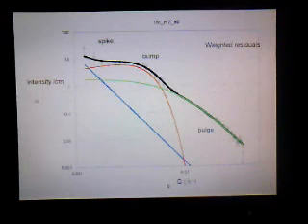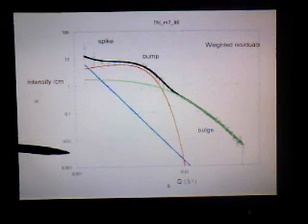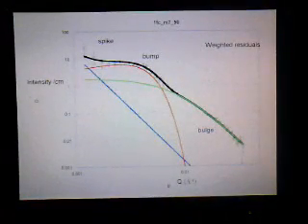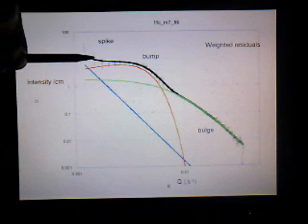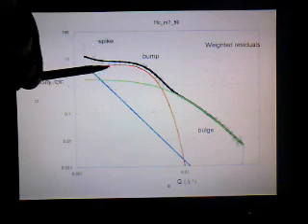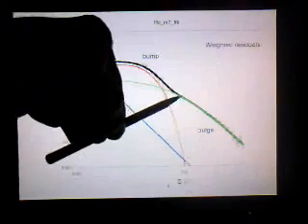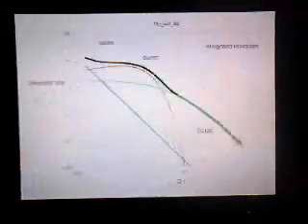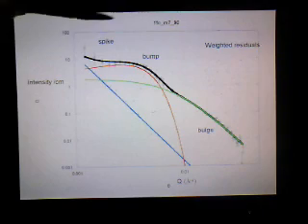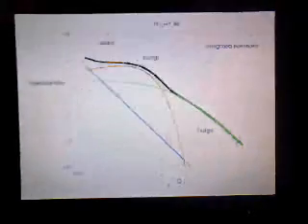So these data show on a log-log scale the intensity of the SANS signal as a function of Q. And there are three features that you need to know about. One is something I call the spike, which is basically an uptake of the scattering as you approach Q equals 0. There is a bump in the scattering, and then there is a bulge in the scattering. And these will be fitted with different functions. The overall fit is given by this black curve.